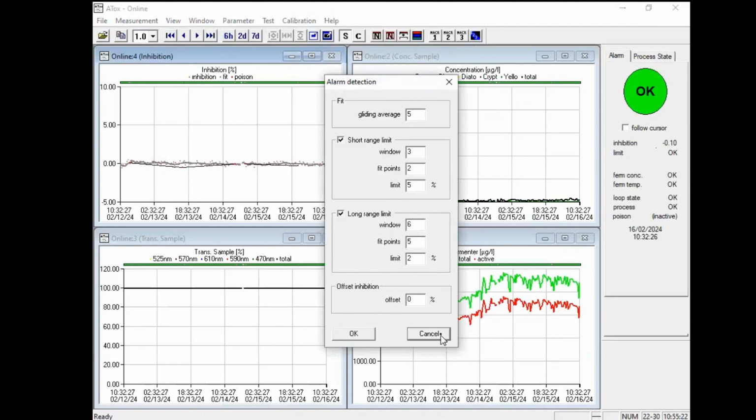But it's somehow dependent on how you operate the instrument, how the sample water changes over time with the load of external algae. Maybe these values have to be adjusted to your situation or your site, your water.